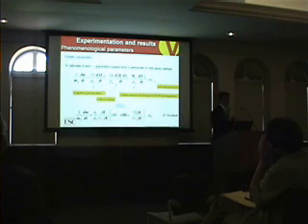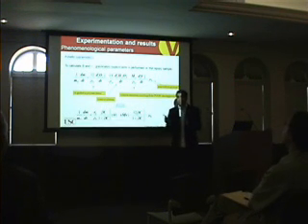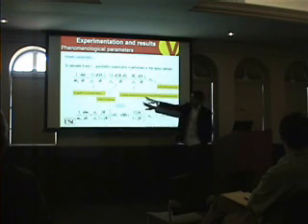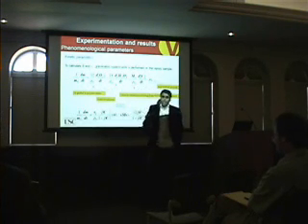You put your sample in a vacuum oven, you still get the weight loss. It's due to thermal degradation of your matrix. But we wanted the part that's exactly due to thermal oxidation. So we had to deduce the one that came from the oven and the one that came from the vacuum oven. Yeah. So when you put your sample, you're going to lose weight. When oxygen grabs your epoxy network, you're going to add some weight.